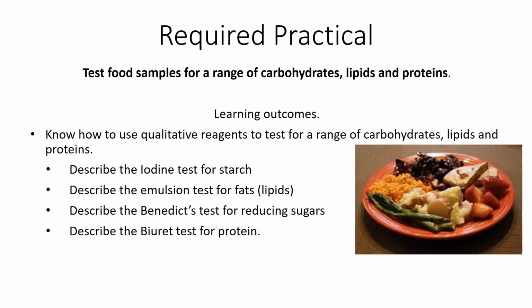So this is a qualitative test, so you can't quantify the amount of starch or fat or reducing sugars or protein available. All you can do is say yes, they're there, or no, they're not. So that is a qualitative test.